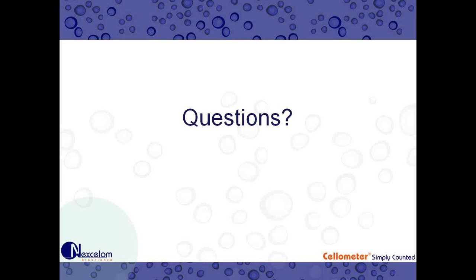Great. So we have another question. This is from Reid, and it is, does the amount of time the cells stay in AOPI before the analysis affect signal intensity? No, it's pretty much an instantaneous stain. What will affect intensity is if it stays in the slide, but that's a webinar for another time.